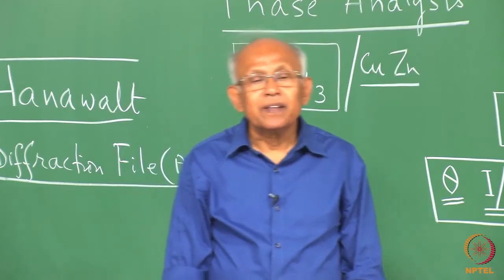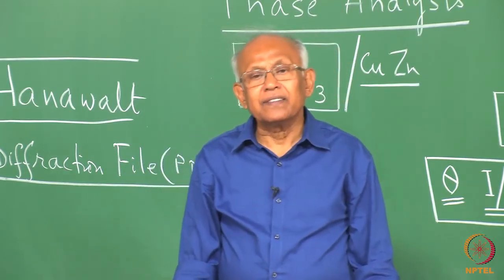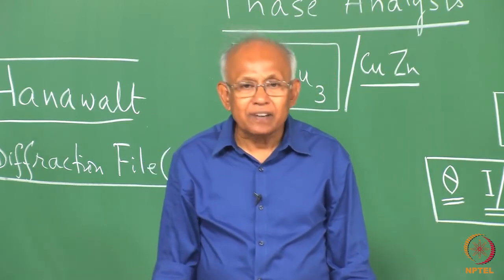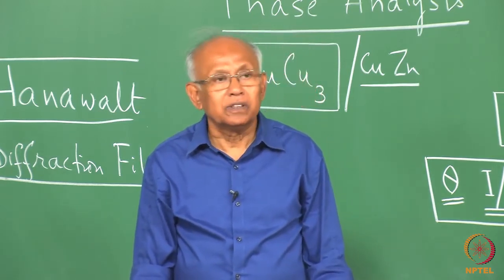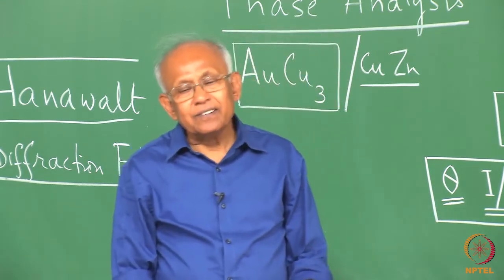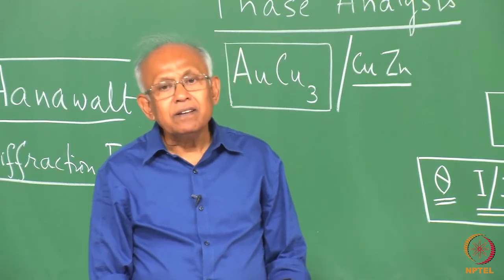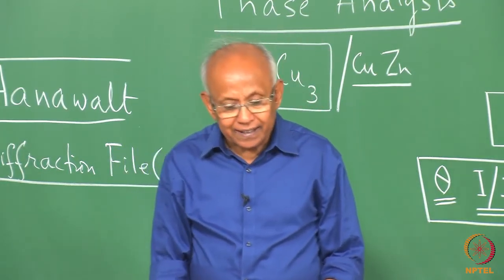Now, if we have hundreds and thousands of materials whose X-ray diffraction patterns were taken by various researchers all over the world, we can produce such a card for each different element, compound or phase and put them for our future reference.